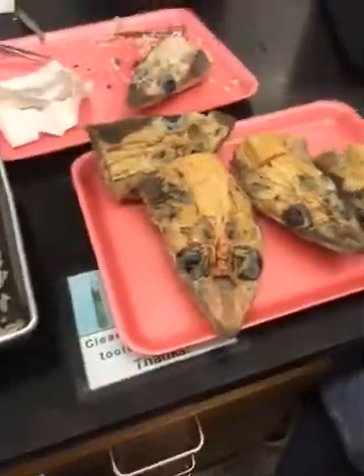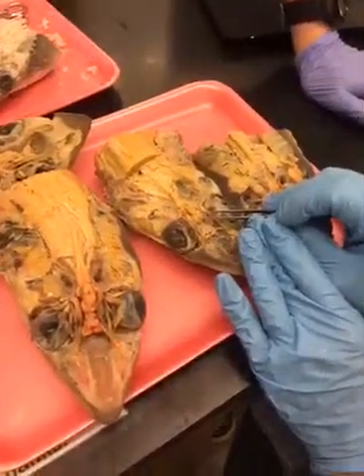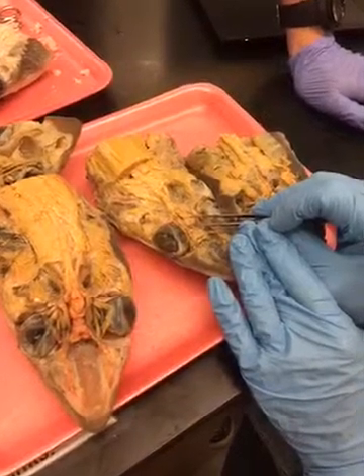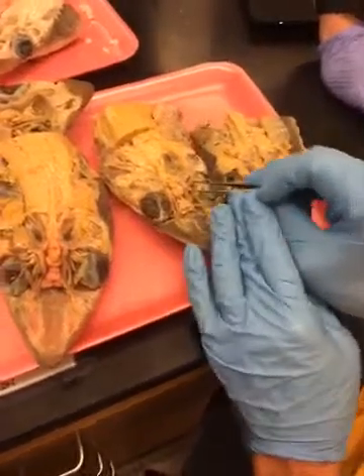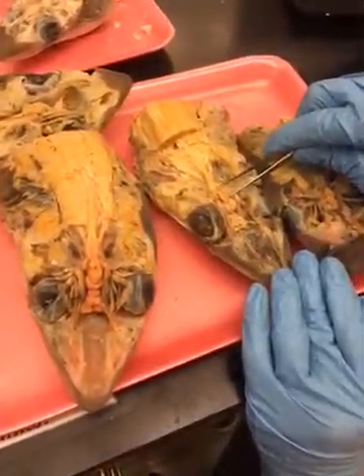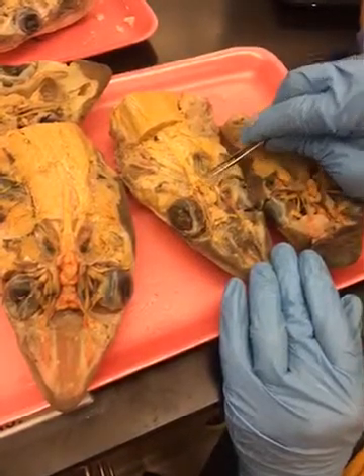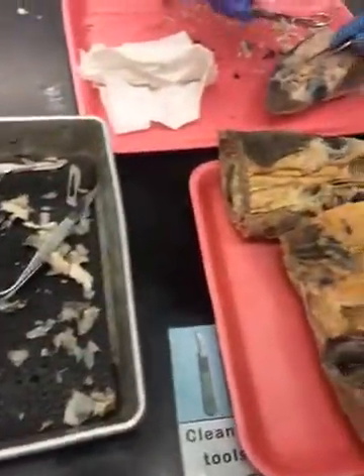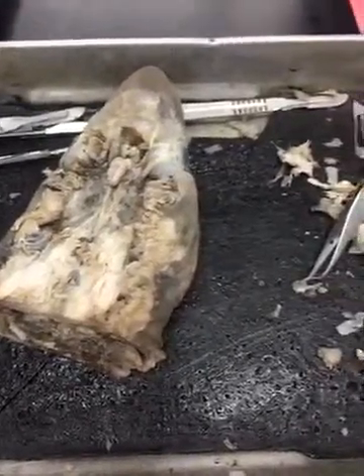Okay, now, moving along. We've done telencephalon, diencephalon, now mesencephalon. Just one thing to know, these optic lobes, okay? So these are involved in sight, just as these are involved in smell. The metencephalon is the cerebellum right here. There's the body of the cerebellum, and then on either side is an auricle of the cerebellum. So there's your big cerebellum there. Not quite, there's your auricle right there.